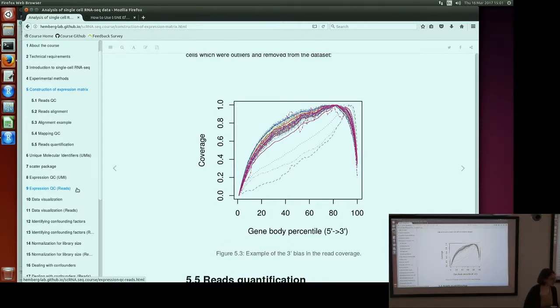This is maybe a point you made about gene length adjustments. Where appropriate, that could be useful for anything where you're comparing expression values across genes, but they're not necessarily always appropriate for doing differential expression testing. Yeah, for differential expression, it doesn't matter because you're comparing the gene to itself.